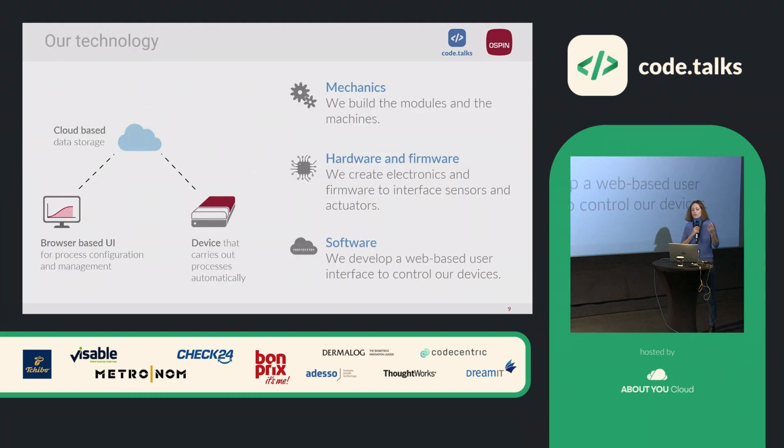So far about the hardware and the mechanical part maybe. Now I think comes a part that is more interesting for us today, which is the software part of our platform, and actually how do we control our platform.